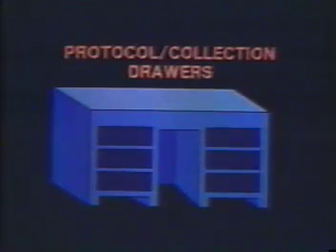Each time you use your FACS Desk, the terminal screen presents you with a view of all the drawers that are stored at your desk. If you open a drawer, the screen shows you what's inside. There are 3 different kinds of drawers you can install onto your desk. Protocol collection drawers store the information that FACS Desk uses to label data as it enters the warehouse. For every new experiment that you run with FACS Desk, you'll need to install a new protocol drawer.